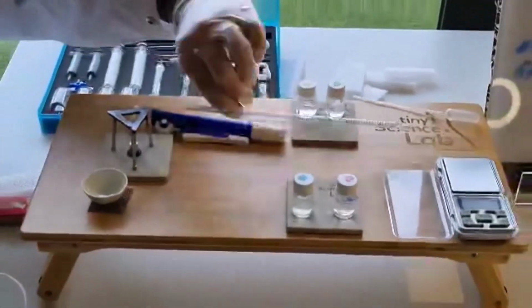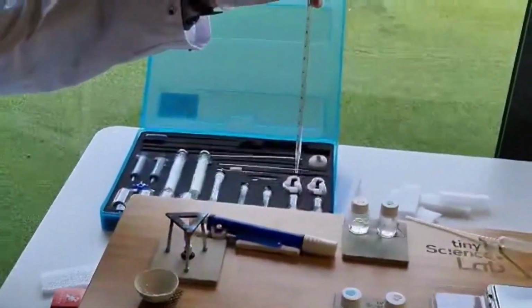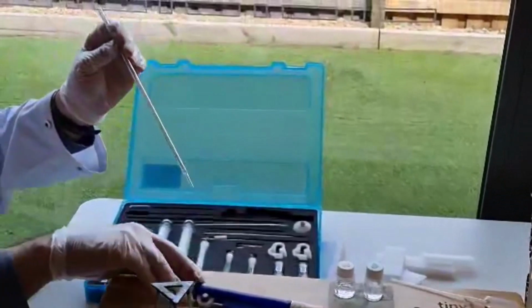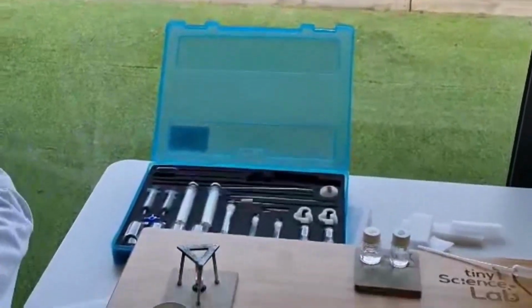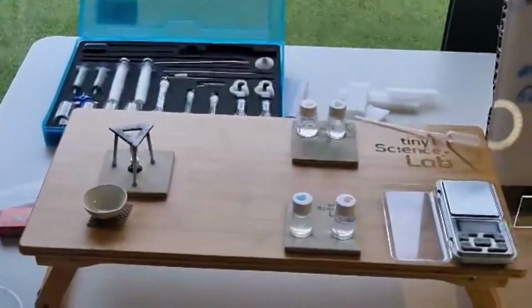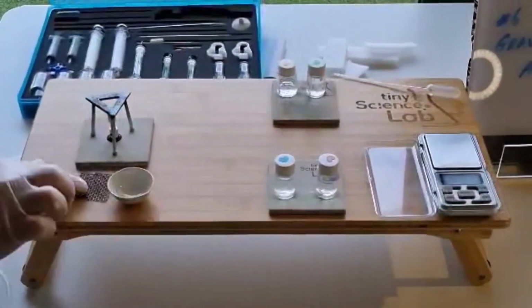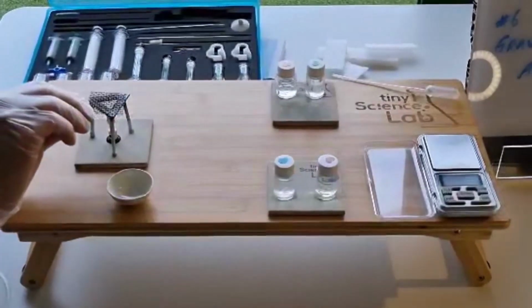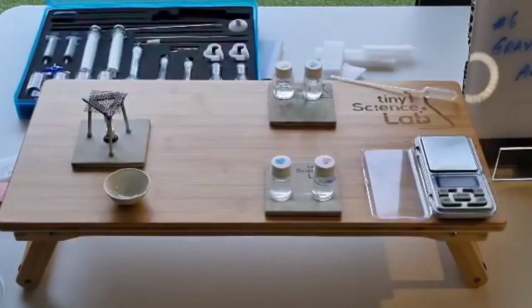What we do have is a really nice graduated pipette. We're going to use this graduated pipette to take some equivalent samples from each of our beaches so that we know we've got the same volume, and therefore when we evaporate the water we can work out exactly what quantity of salt we have in each of these samples.